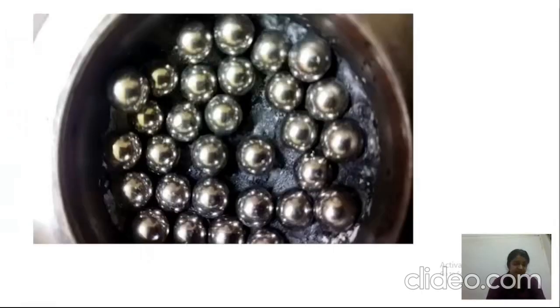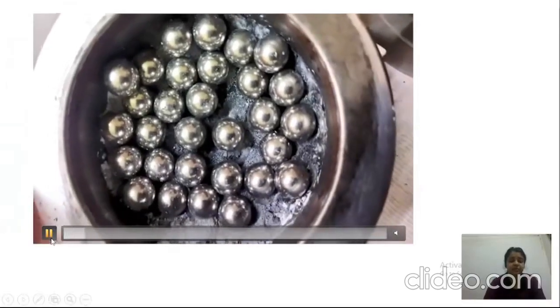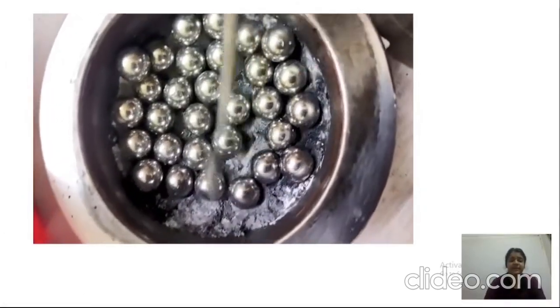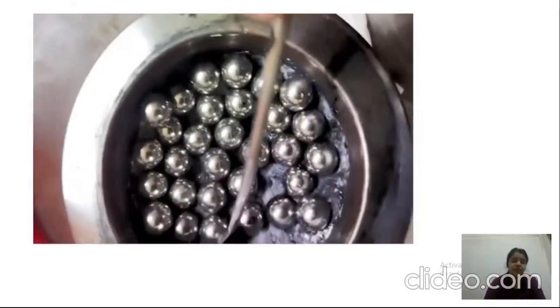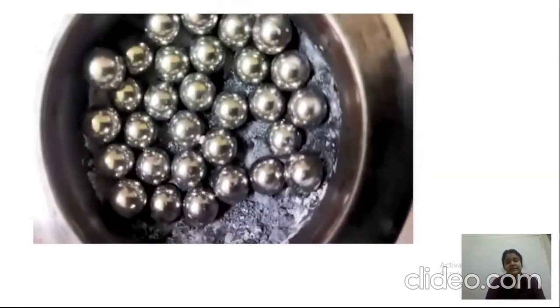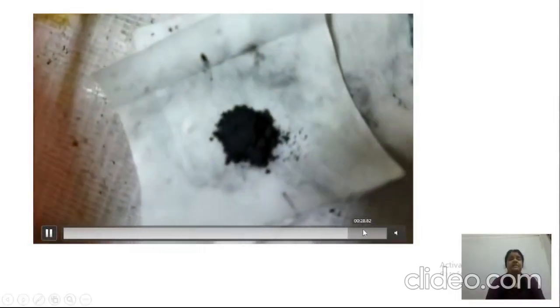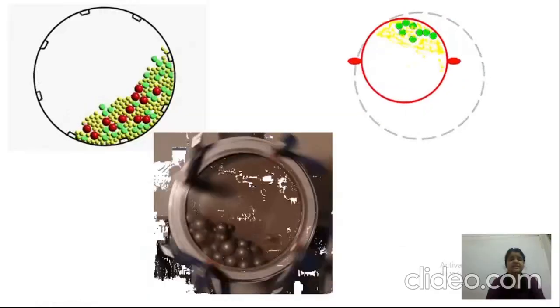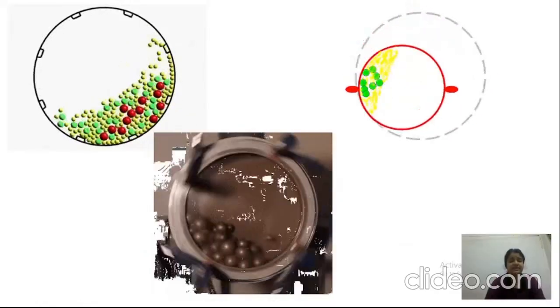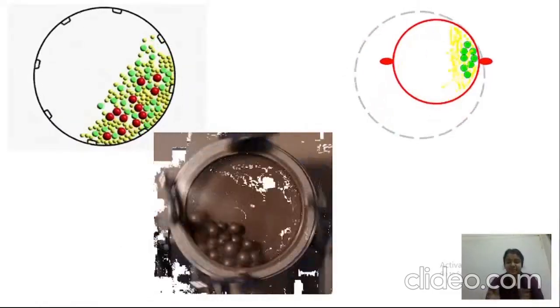After the ball milling of several hours, that means around 3 to 4 hours, we can prepare these types of nanocomposites, and we should collect it and then send it for the several structural and microstructural studies. That means we can characterize it by several microstructural studies like X-ray diffraction study, SEM study, TEM analysis, etc. So this is basically a one pot synthesis method.